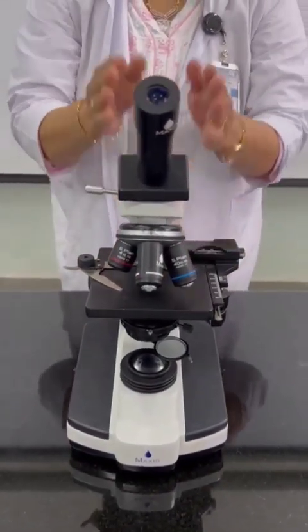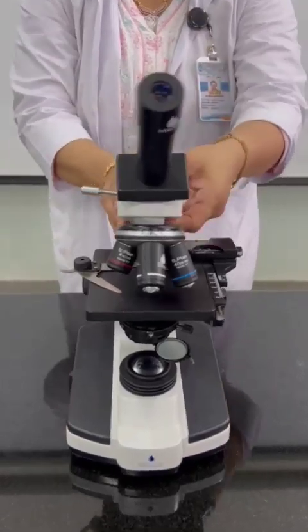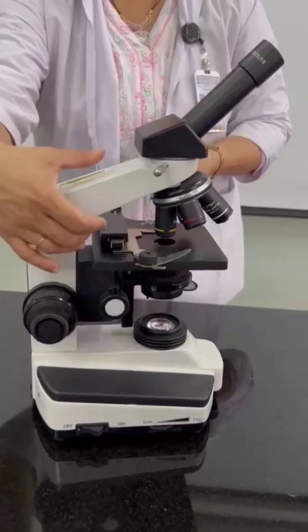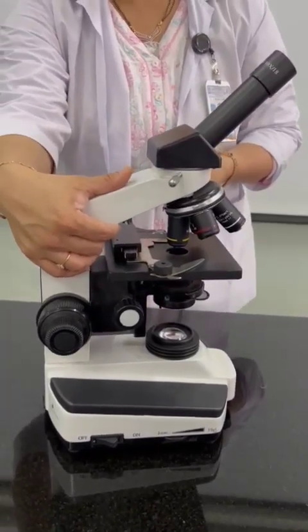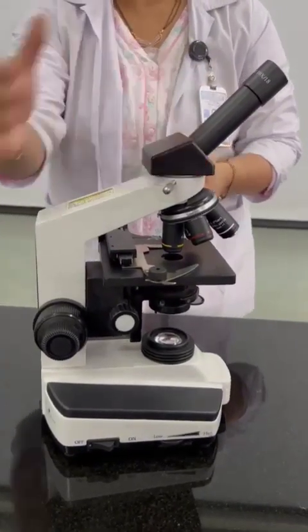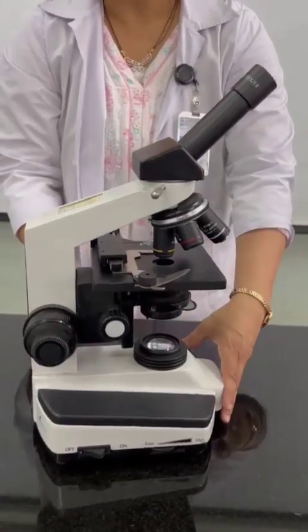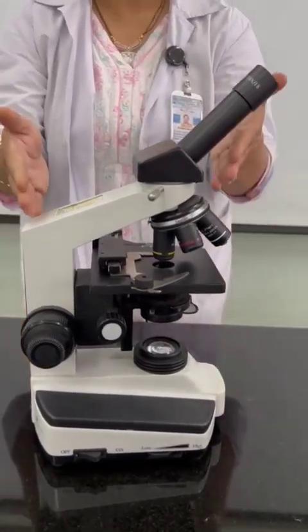Coming to the other parts of the microscope, as we can see here, this is the arm of the microscope with which you can hold the microscope. At the same time, it connects the suprastage to the substage parts. This is the base of the microscope which holds the entire body of the microscope.